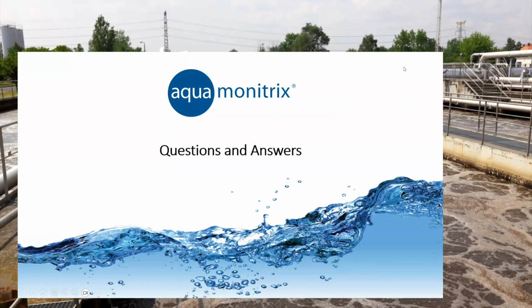We do have a couple of questions that have come through in the Q&A. One of them is to do with the settling device. Somebody's asking, what do you do if the sludge has different settleability? You said there was a process time of 4 minutes. Is that something that's fixed?